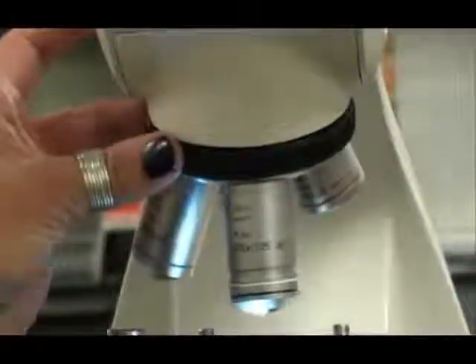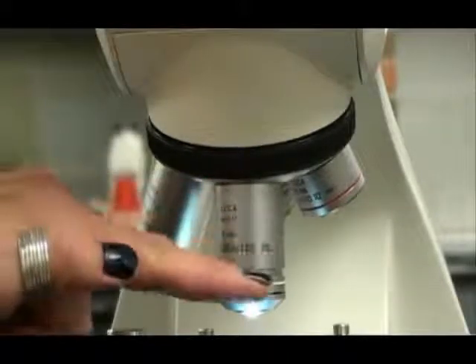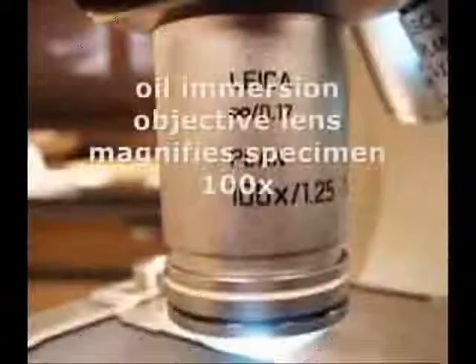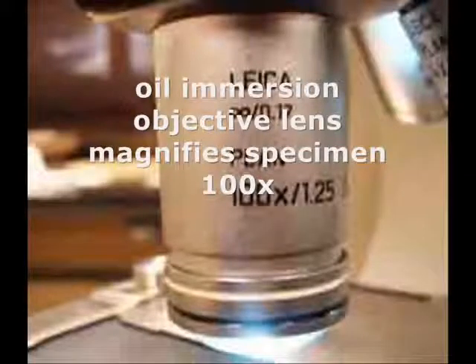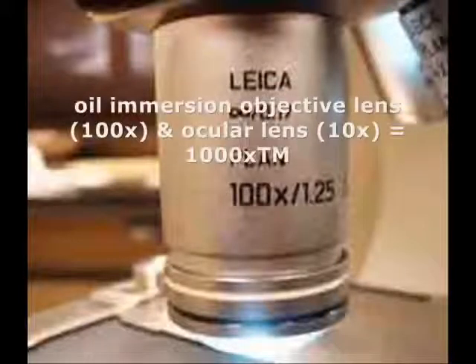Compound microscopes typically have three or four objective lenses. If you have a fourth lens, that would be the oil immersion lens. It has a black-and-white band around it, magnifies objects 100 times actual size, so together with the ocular lens of 10 times magnification, you can get a total magnification with oil immersion of 1,000 times.